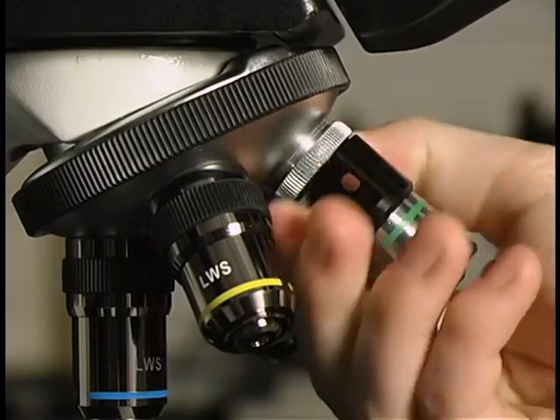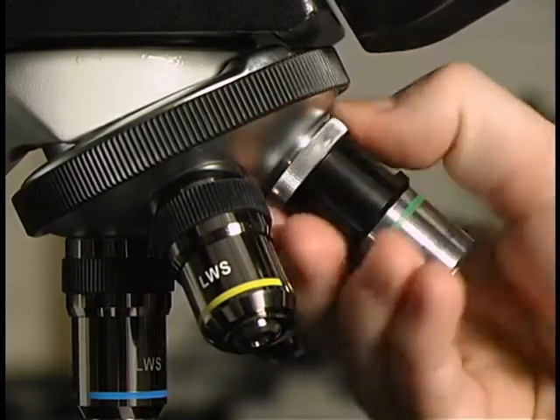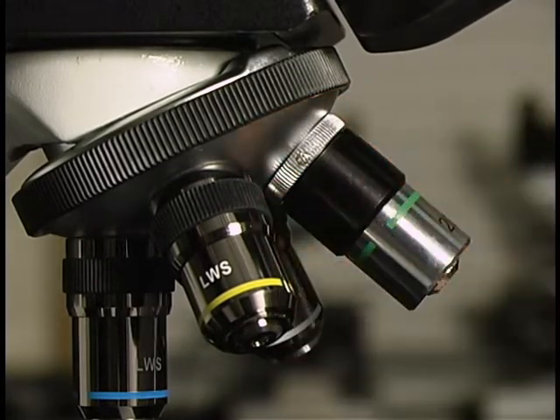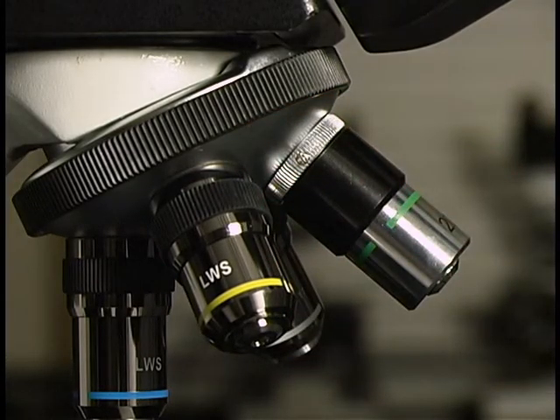To attach the Paralens Advance body to a standard light microscope, thread the body directly into the nose piece until the attachment is tight and secure. Be careful not to force the Paralens Advance into the threading when attaching, as this could potentially damage the Paralens Advance as well as the microscope itself.